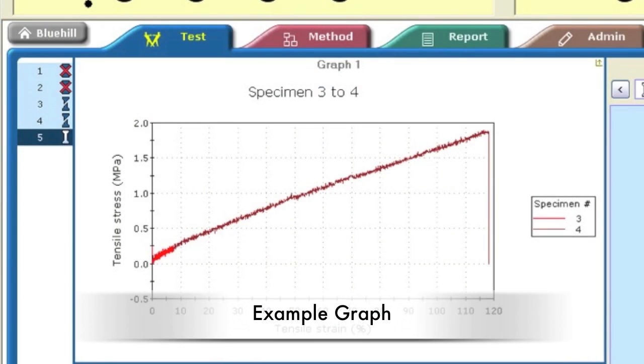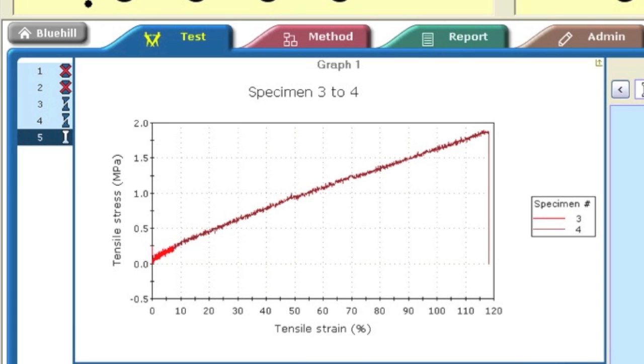This is an example of a typical tensile test. The graph shows the tensile stress and strain, and the drop off indicates the failure of the sample.